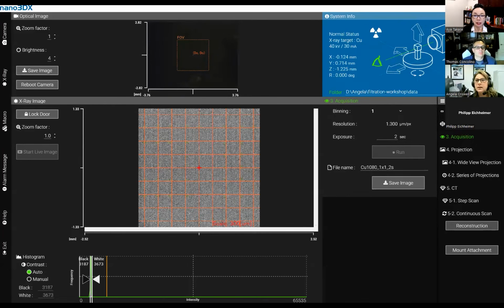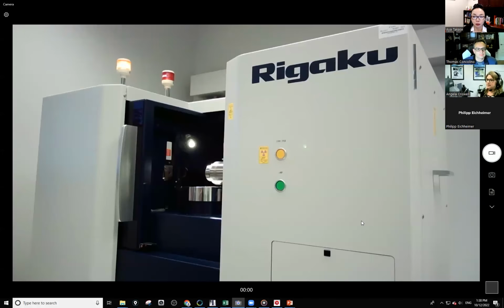Angela, we're still looking at the control software. Right. Yep, switch your camera view. New share. I selected the individual application rather than the whole screen. Oh, now I've got the whole screen. So hopefully you should see it now.